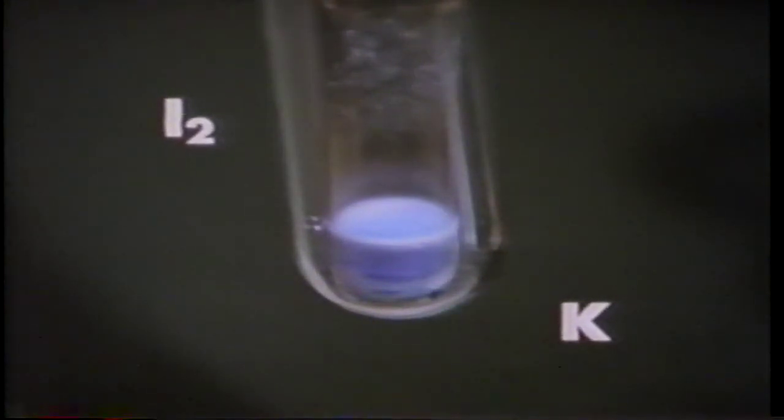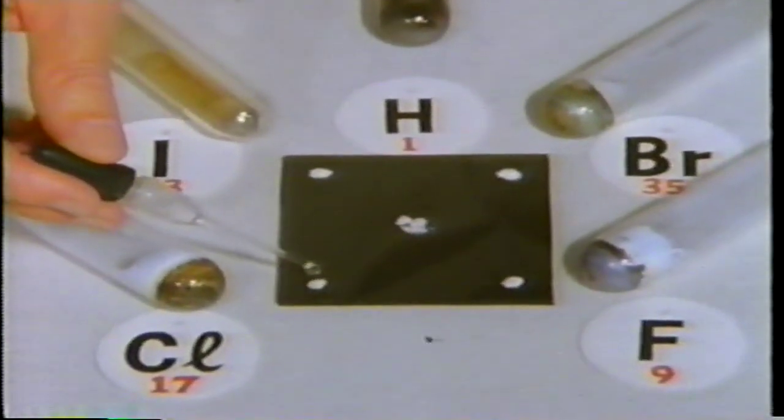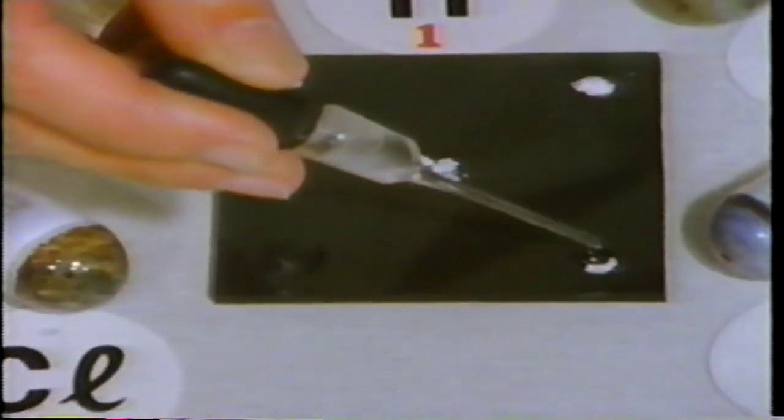In a few moments, iodine enters the inner tube and reacts with the potassium, producing solid potassium iodide. We remove some of the potassium iodide and the other 4 products and check their reactivity with water. The chlorine compound dissolves quietly. So does the fluorine compound.